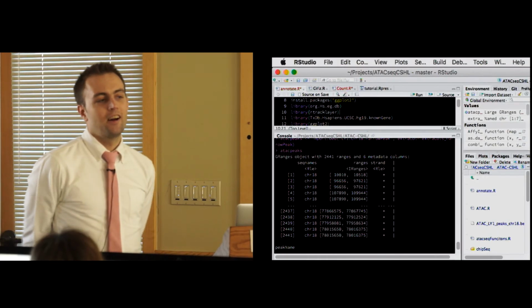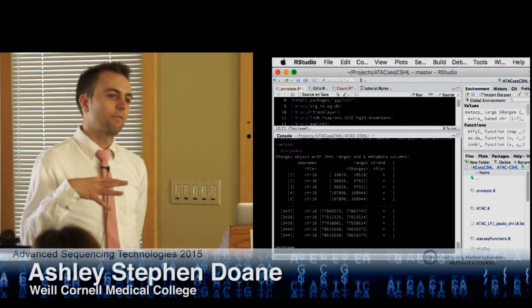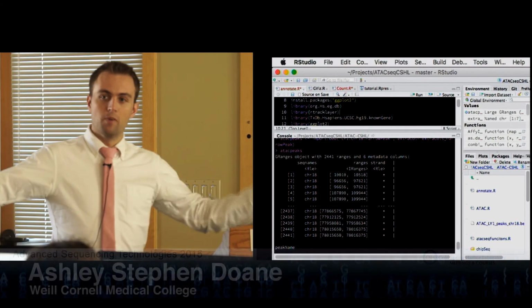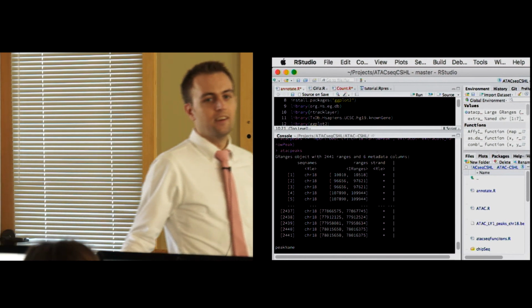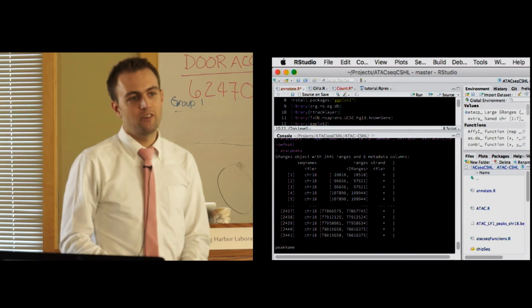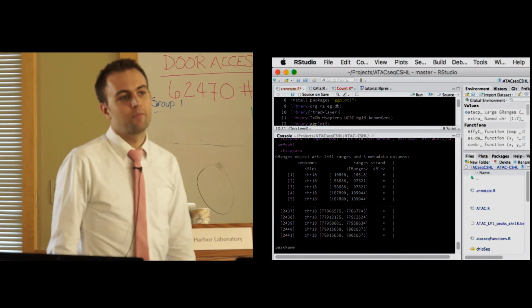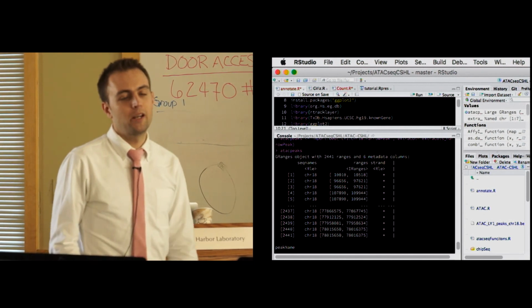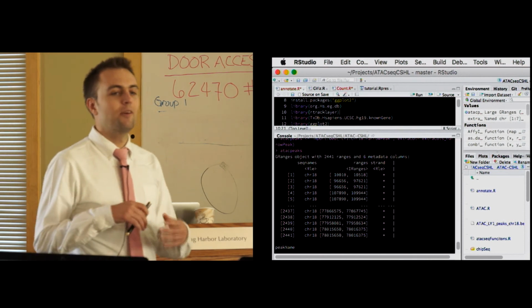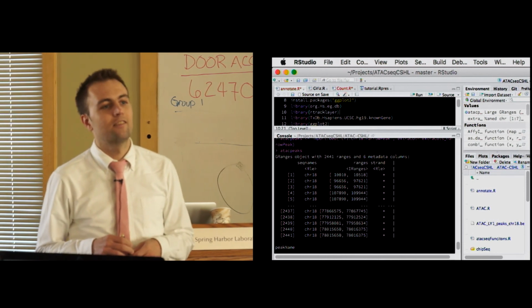So people sometimes refer to ChIP-seq transcription factor peaks as narrow peaks, and histone marks, which are larger regions, as broad peaks. It's a little bit confusing in that ATAC-seq can kind of do both for you in some ways, but it's probably more of the narrow peak. The data looks probably more like a narrow peak. But in any case, that's where the name of the file comes from. So BED files have a number of varieties and flavors, and this flavor is called a narrowPeak file.